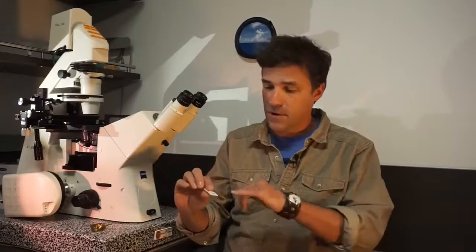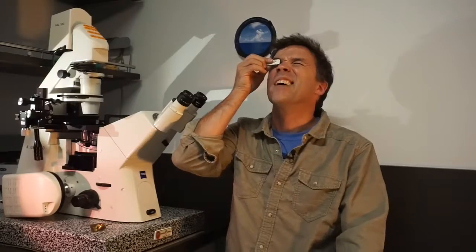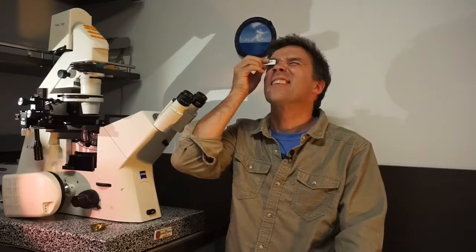So by now you should have yourself a little paper microscope that should work great. I've already showed you how to focus it, and all you have to do is mount your specimen on there, get your finger on the focus, hold it up to the light, and tweak it until you can see it coming into focus. You can also mount these right on your cell phone, which is what I've done to take the microscopic pictures in this video, and you treat them exactly the same way. Just tape it over the lens of your cell phone so you can see the screen, and then pivot the sample up and down to focus.